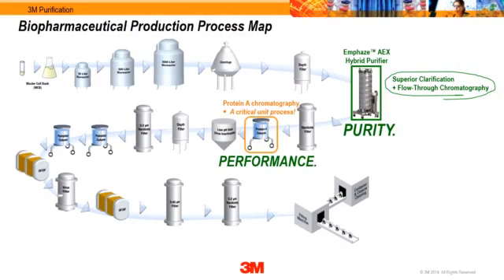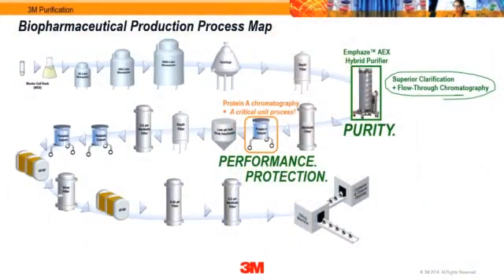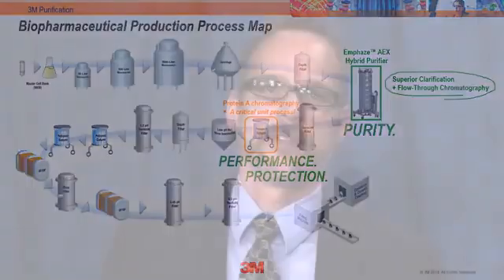Additionally, we know that column lifetimes are ultimately limited by the aggressive cleaning procedures, like sodium hydroxide clean-in-place procedures, that we need to use between batches to remove column-bound impurities. Just as rinsing the dishes better reduces the need to empty the dishwasher filter, loading fewer impurities onto the Protein A column may enable a reduction in the frequency of harsh cleaning procedures. This could substantially extend column life.